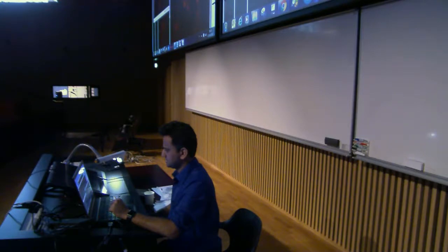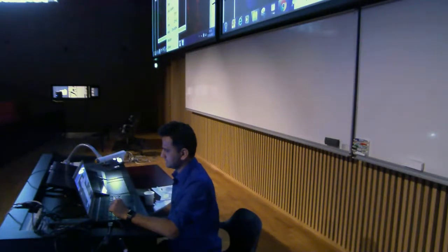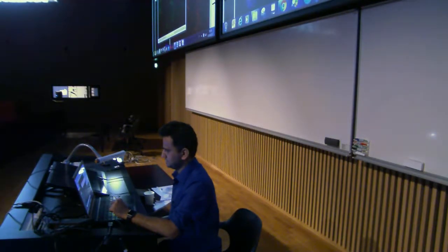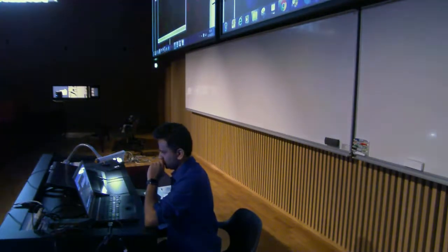Somehow that is gone. And if you put it as overlay. Yeah, I think so. So let's go and make it as a selection. Edit, selection, and create selection. No. Show overlay.